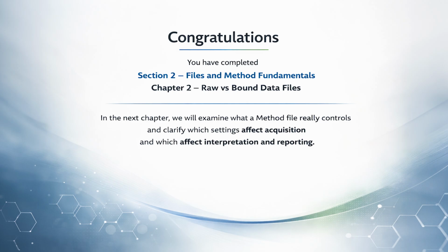Congratulations! You have completed Section 2, Chapter 2. In the next chapter, we will examine what a method file really controls and clarify which settings affect acquisition and which affect interpretation and reporting.